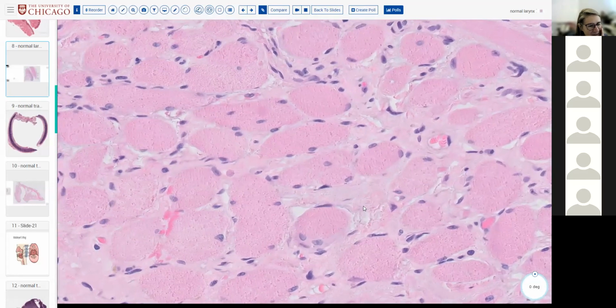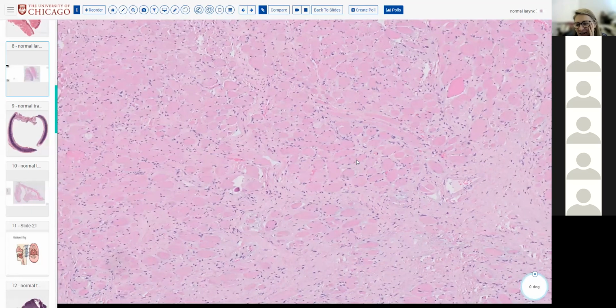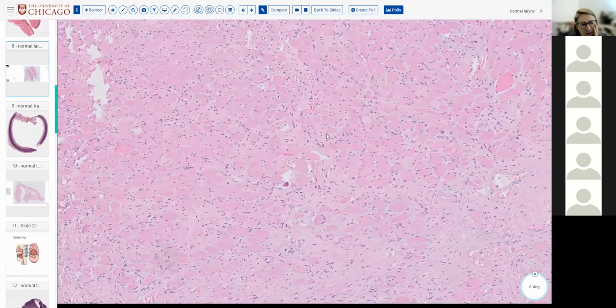Can you see that on your phone? It's so bad. I'm so sorry. Who wants to see what I'm showing here?